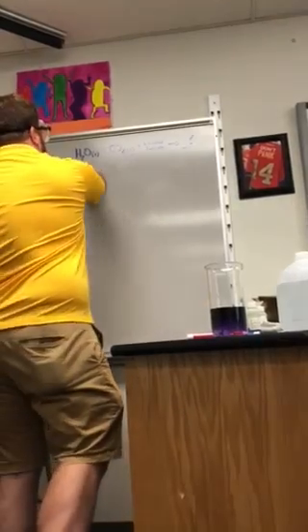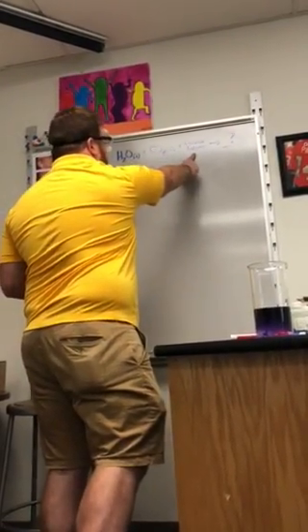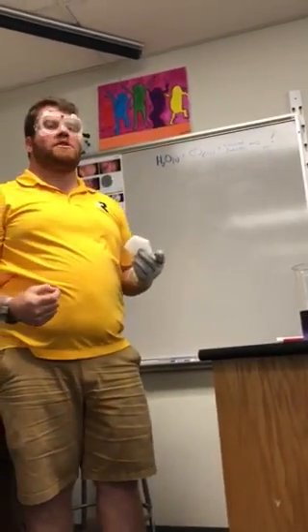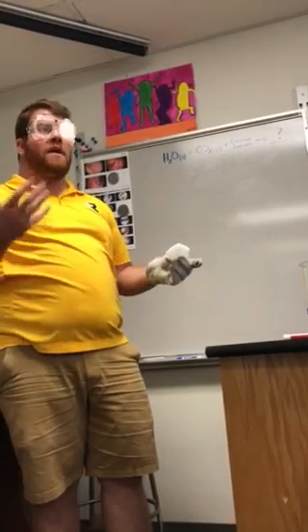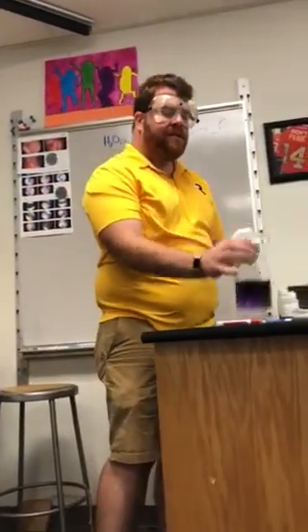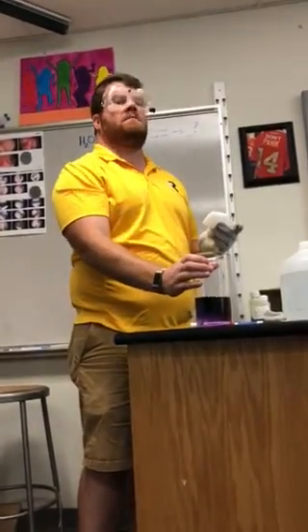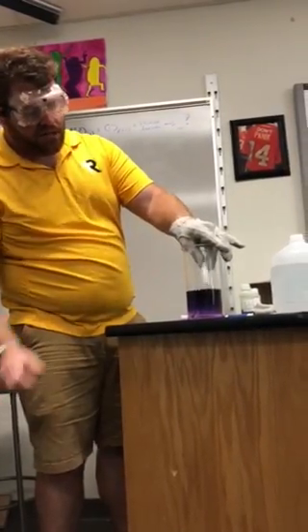So right now we currently have H2O and indicator. When I put this CO2 in here, there will be a chemical reaction that occurs, okay? And so we will see this. I'm telling you this right now. There's a chemical reaction that's occurring, but you have to figure out the product. So this is beautiful, right? This is a beautiful color. You know, I would love to have that in my wedding, maybe, okay? Yes. I don't know, okay? But then I'm going to drop this and watch this.